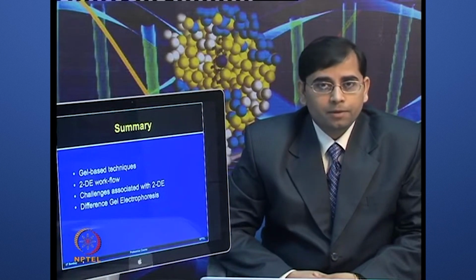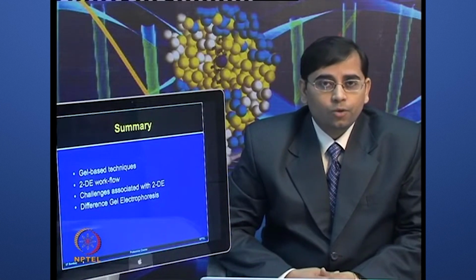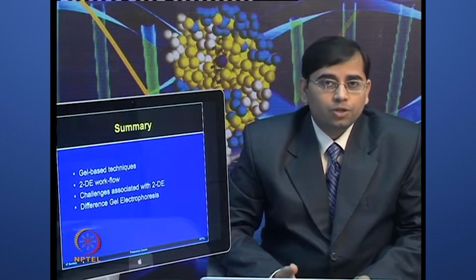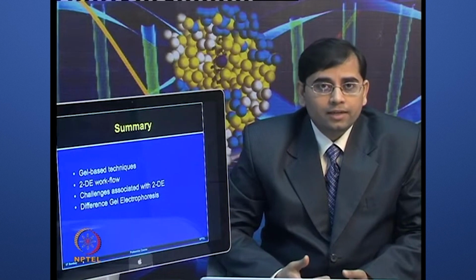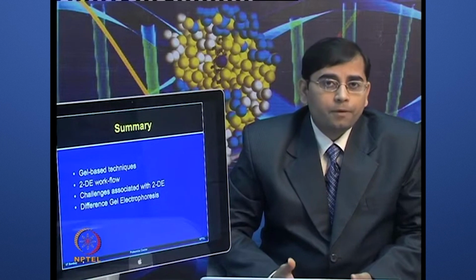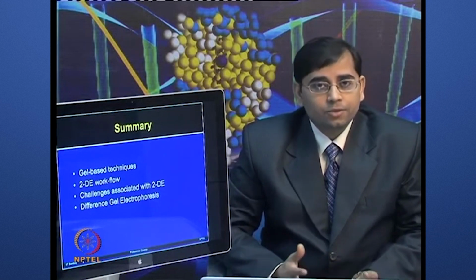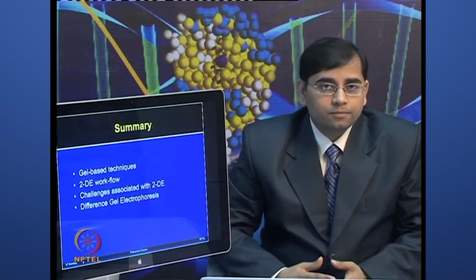I hope at the end of this module and lecture you will be able to perform a gel based proteomics experiment. But please keep in mind, these protocols and methods are only giving you a feel for performing these experiments. Each experiment, each sample type, each biological question brings its own unique challenges, and depending upon those conditions and your sample type, you need to optimize these methods. There is no one technology which can answer all of your questions, but it is a good idea for you to know what different methods are available for you to use.